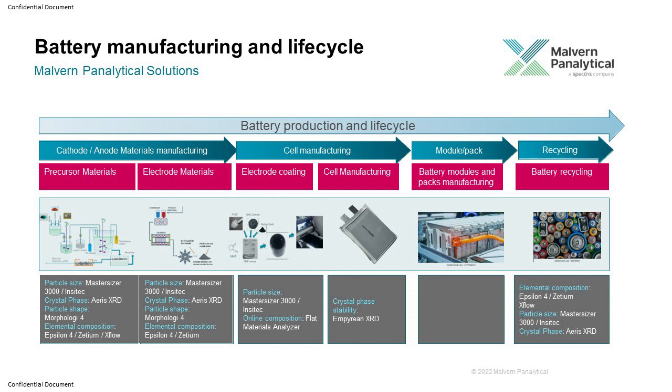In the battery cell, we have a special technique called in operando XRD. During the charging and discharging of the cell, you can look at what the phases are, how the phases are changing inside the battery, and how the structure is changing. And from that, you can derive or predict whether this battery will give you good performance or not with the charging, discharging cycle. So we can do that.